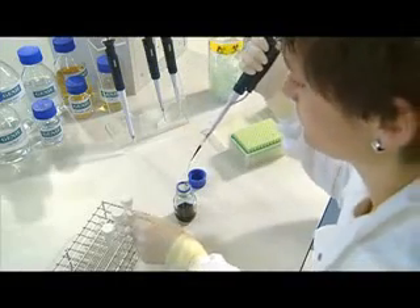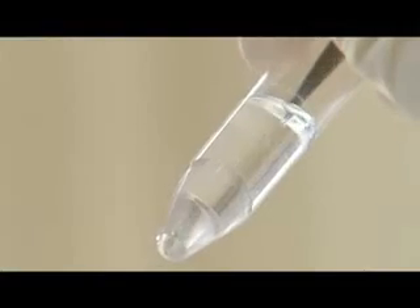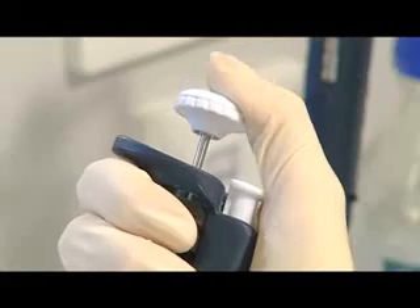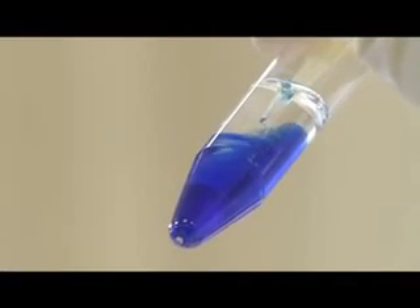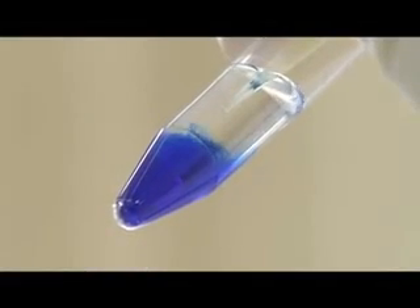Withdraw the pipette tip from the liquid and place it inside the recipient container. Slowly push down on the push button. This will release the liquid in the pipette tip into the tube. This time, push beyond the first stop. This ensures that any residual liquid is expelled from the pipette tip.